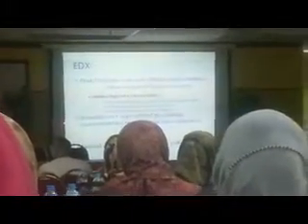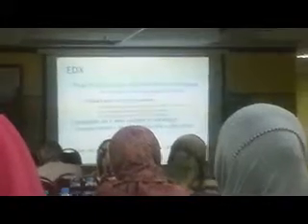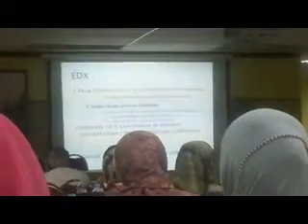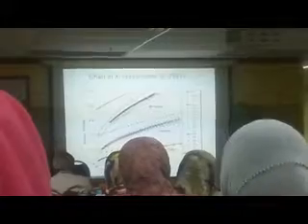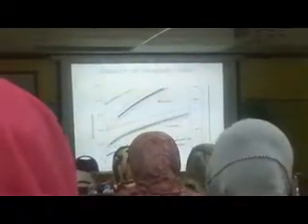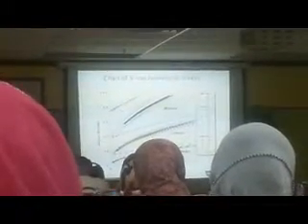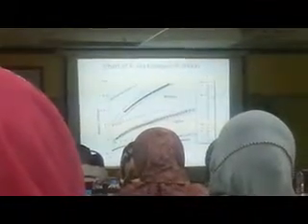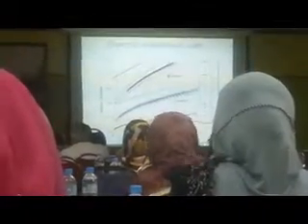But coming to the peak position, just the peak position cannot confirm what element it is because, for example, K alpha of one element might be the same as L alpha of a different element. As I have shown in this slide, for example, you found a peak at 2 keV. This 2 keV peak can be related to K alpha of this element. The y-axis is the element, the x-axis is the energy. So this 2 keV can be related to K alpha of this element or L alpha of this element.